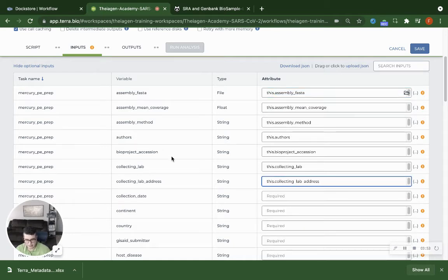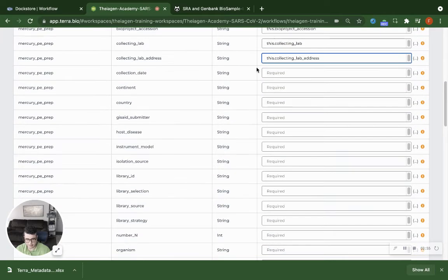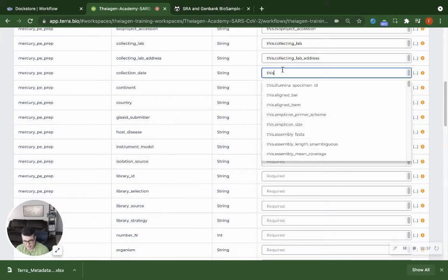So as we see here, I am just entering in all of the required fields.